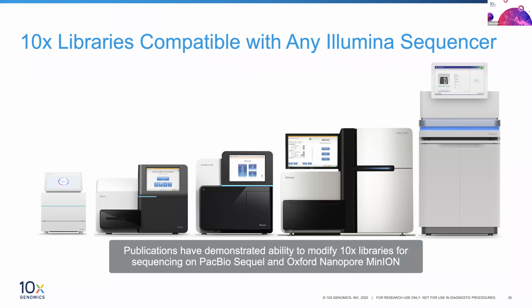And while spatial analysis by itself is a really powerful tool, many groups have already started leveraging already existing or soon to be generated single cell data in ways that can enhance each other. So I've seen people who are starting with Visium, and they're adding single cell data at the same time to help refine spot clustering information that comes from the Visium spatial assay.